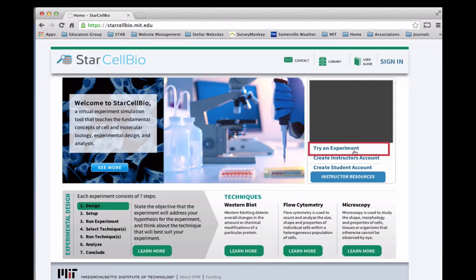Click try an experiment to use StarCellBio as a guest, or set up your own student account to get started with StarCellBio now.